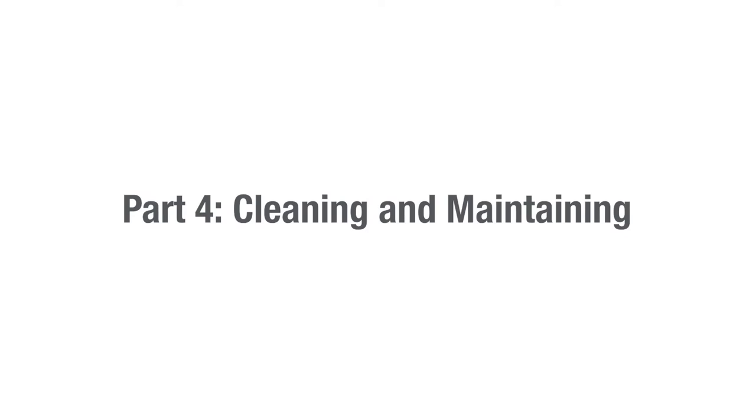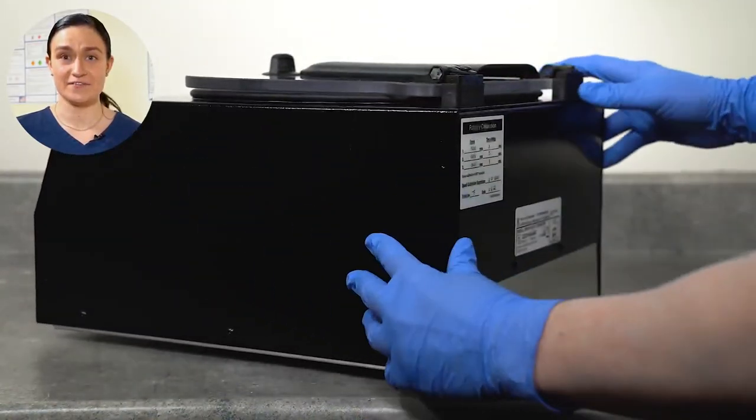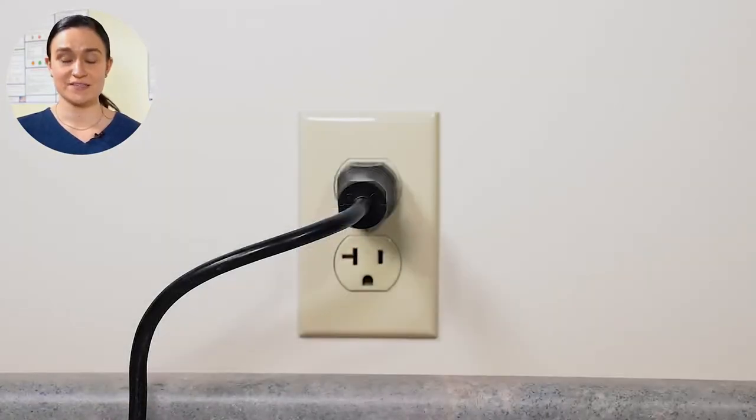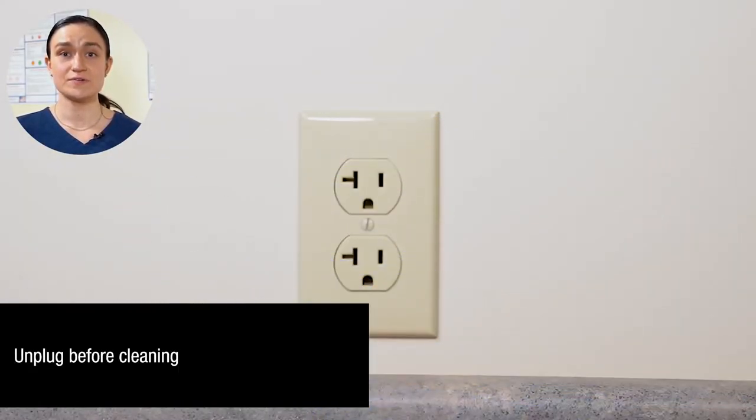Now let's look at how you should clean and maintain your Dash Flex 12 — Part 4: Cleaning and Maintaining. Your Dash Flex 12 requires no regular maintenance and cleaning is easy. Start by locating the power switch on the back of your Dash Flex 12 and turn it off. Next, unplug your Dash Flex 12 from the wall socket. It is important that your Dash Flex 12 stay unplugged for the entirety of the cleaning process.